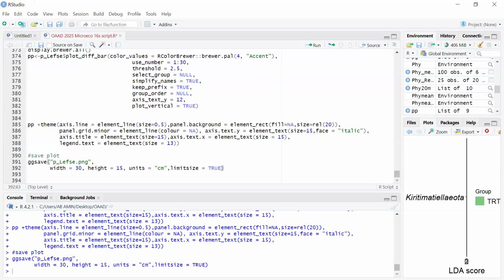We just find which one is which. Then we look at all their characteristics and see which one is good for our intention. We have patented so many lactic acid bacteria and deposited their sequences in NCBI.